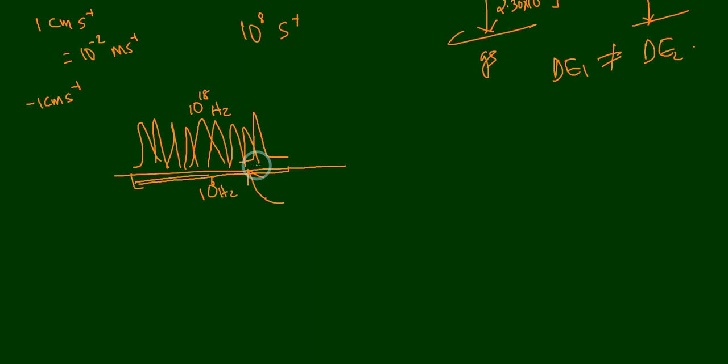By the Doppler effect, we can cover a broad region, and within this broad region, somewhere the sample absorption frequency will fall. So the Doppler effect comes here as a blessing. We can utilize the Doppler effect. And how can we do this in the laboratory?